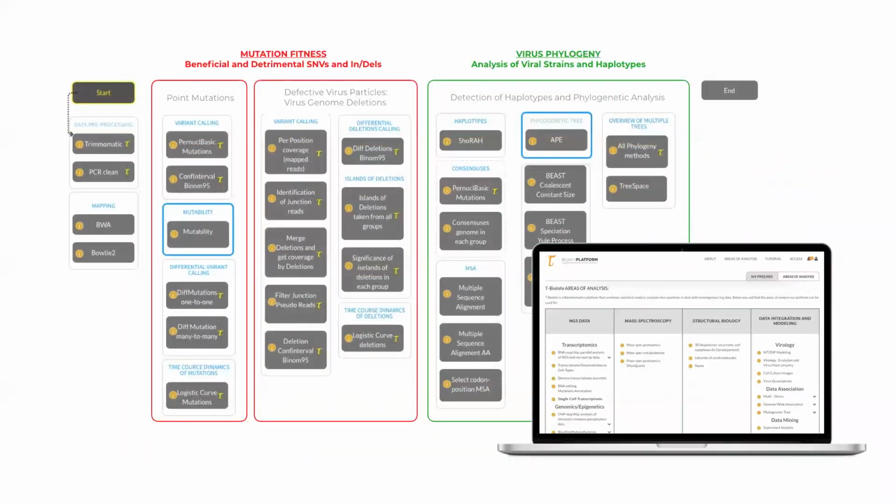A challenge in analyzing so many genomes at once and comparing them at multiple levels occurs because we're doing this from nucleotide, amino acid, and then organizational properties. And this challenge is that the simple tools on NCBI do not allow for such flexibility or processing power.